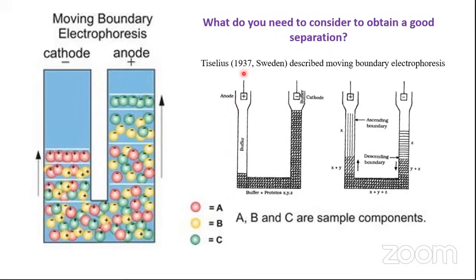On the basis of whatever understanding we have of electrophoresis till now, do you think that this is an important point to be considered, that one should know when the process should be stopped? According to you, is it an important point? Yes, it is indeed an important point that one has to focus upon: when should the electrophoresis procedure be stopped.